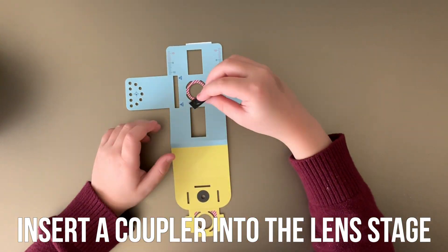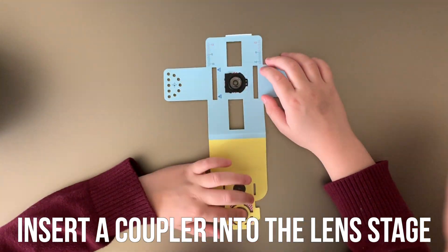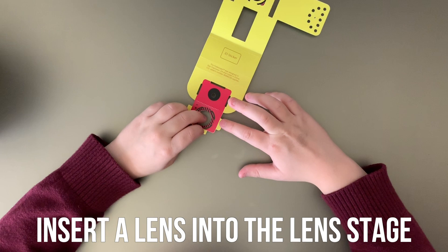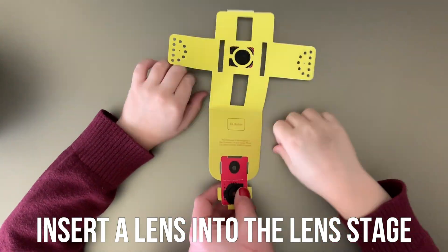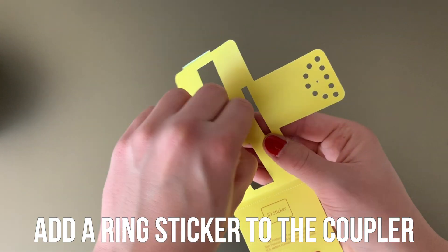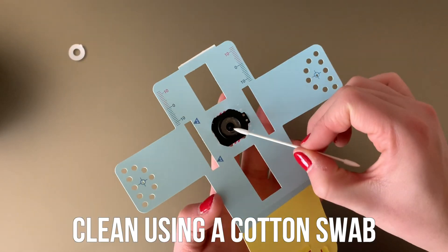Start by inserting a Coupler into the Lens Stage, ensuring that the dots match up. Then carefully insert a Lens into the Lens Stage — again, make sure that the dots line up. Next, add a Ring Sticker to the Coupler, peel off the white side, then stick on a Lens. Carefully clean this using a cotton swab.